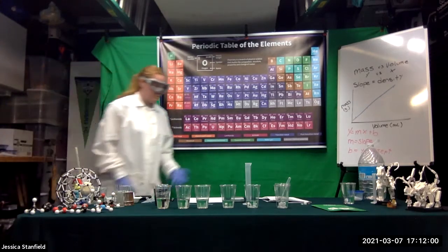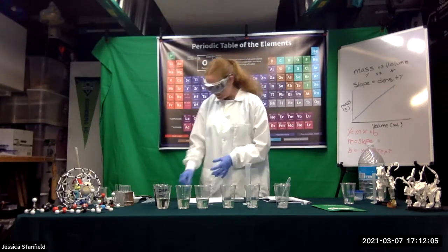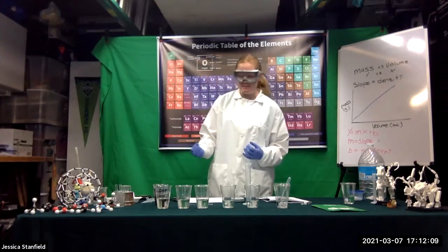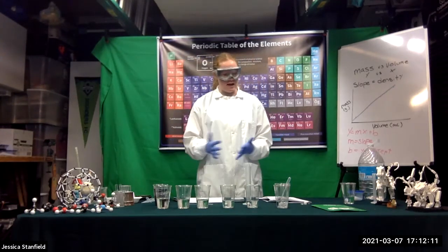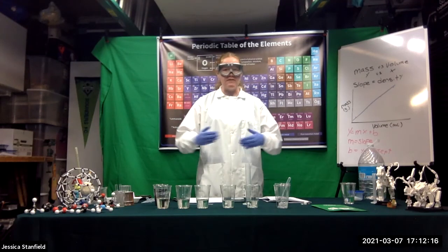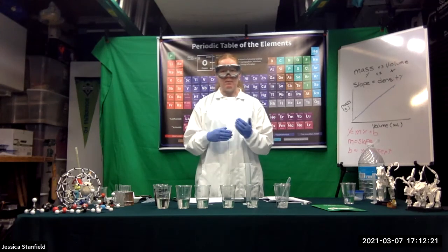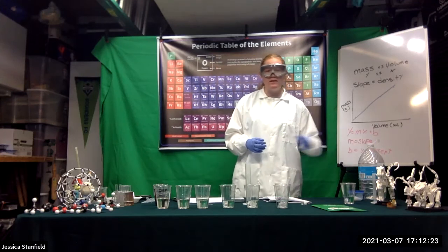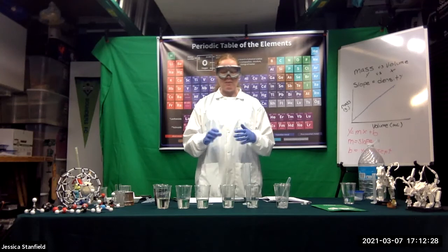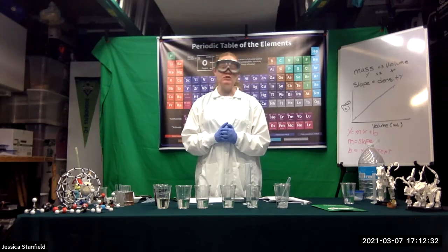Okay, so again, that is our experiment. Remember, record your data in ink, do your calculations in pencil, make sure you're wearing proper PPE, and when you're all done, these are just sucrose solutions, and that's a beverage, so everything can go down your sink. Wash everything really well first with tap water, and then give it a rinse with your deionized water when you're all done to make sure that none of the residue from the tap water gets stuck on your glassware to contaminate further or future experiments.